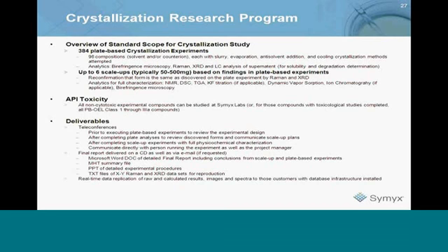Some of these customers have then brought the equipment into their labs to enable their own research. And in some cases, we have examples where people have brought things into their labs. They continue to do the work, and occasionally they actually use our labs to either do additional capability or handle additional capacity that they may need.